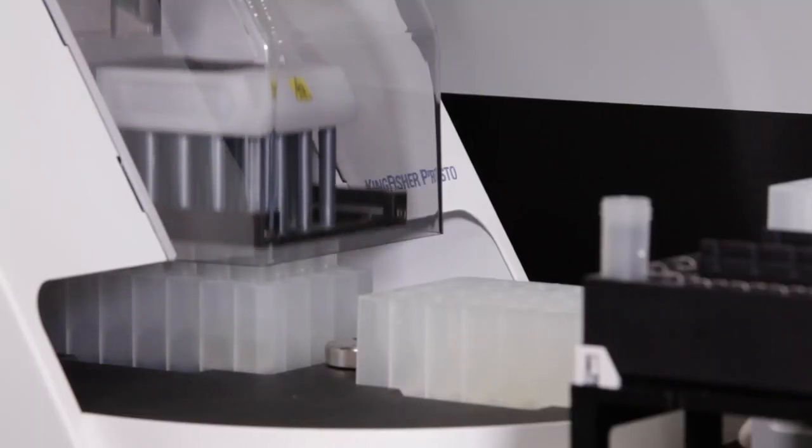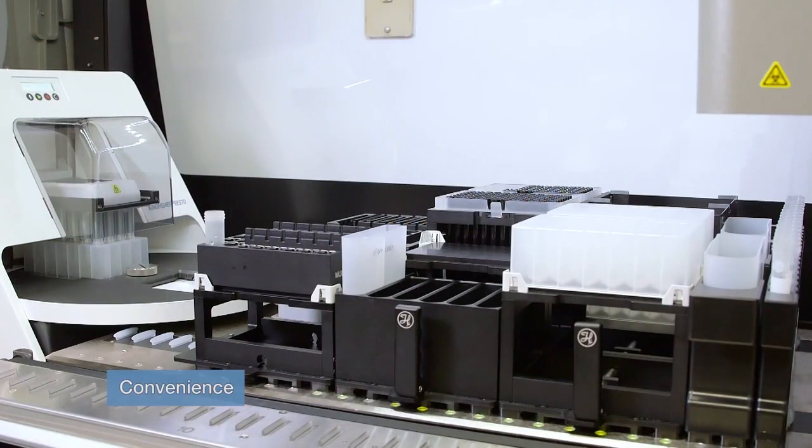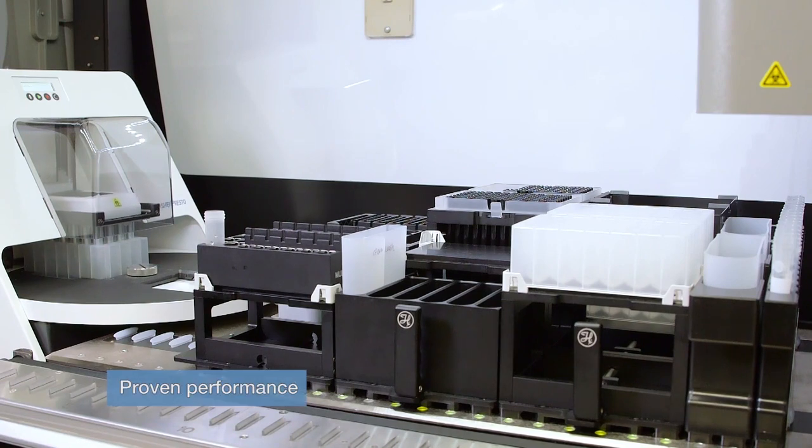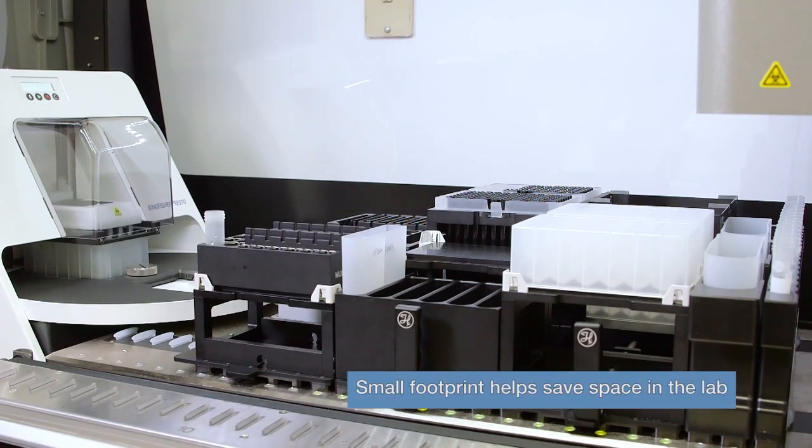The Kingfisher Presto system helps you streamline a variety of biopharmaceutical, biotechnology and other high-throughput laboratory application workflows, saving precious time and costs in the long run.